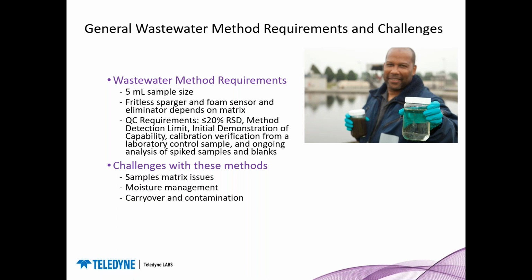So there are sample matrix issues. Moisture management is always a concern with purge and trap, and so are carryover and contamination. So, sample matrix issues: wastewater samples tend to be a more complex matrix, like a combination of solids or particulates and volatile compounds, which we're interested in.